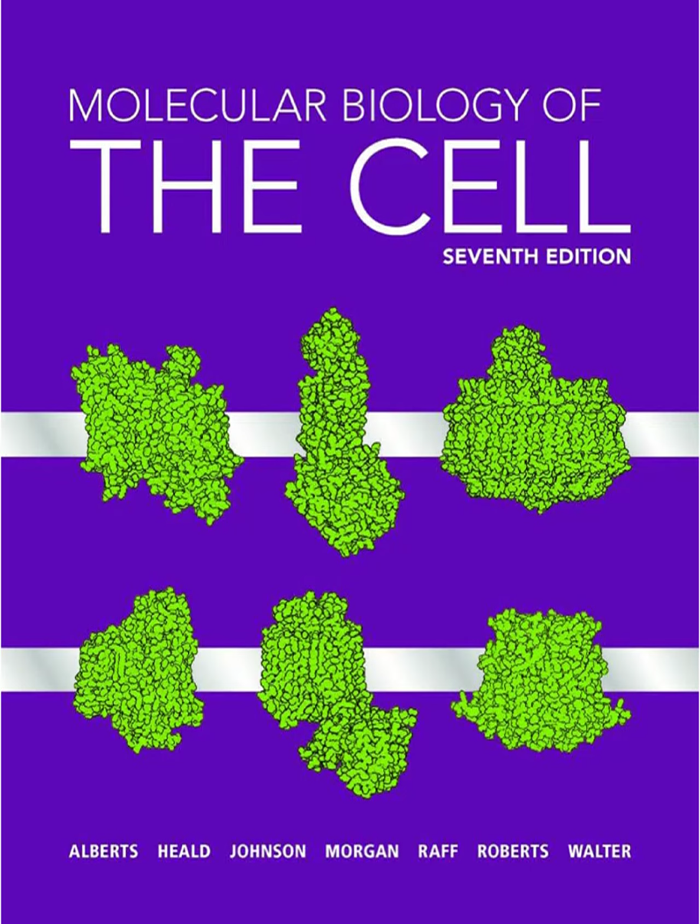Exactly. You image those few molecules, pinpoint their centers precisely, and then they either bleach or you switch them off. Then you repeat the process, activate another sparse subset, image them, locate them, turn them off. Over and over again, thousands of times. Tens or hundreds of thousands of times. Each cycle captures the coordinates of a few more molecules. You build up a list of millions of precise molecular coordinates. Then, you reconstruct the final super-resolution image by plotting all those coordinates. That's incredible. It's like building the image molecule by molecule. Pretty much. It has revolutionized light microscopy, allowing multicolor imaging, pushing towards live cell imaging, and revealing cellular structures at near molecular detail.